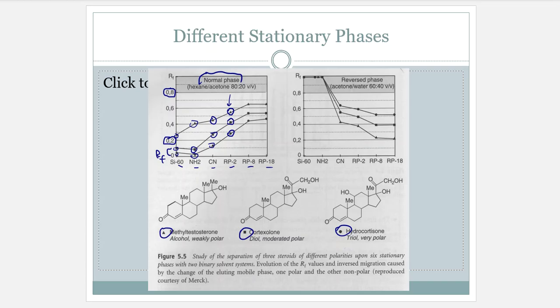What this has been about is separation, absolutely. But it doesn't mean get it as separated as you can. That does not make any sense sometimes. We want the components separated from each other, but we also want the components in a working realm that is 0.2 to 0.8 as far as RFs go. And if that means that my components are going to be squeezed together a little bit more, but separation's still there, folks. Look at it.